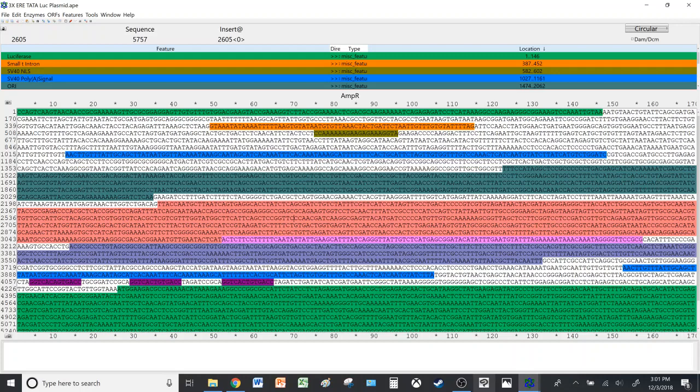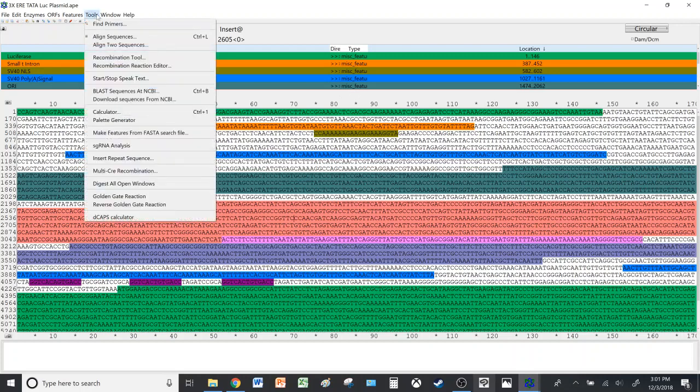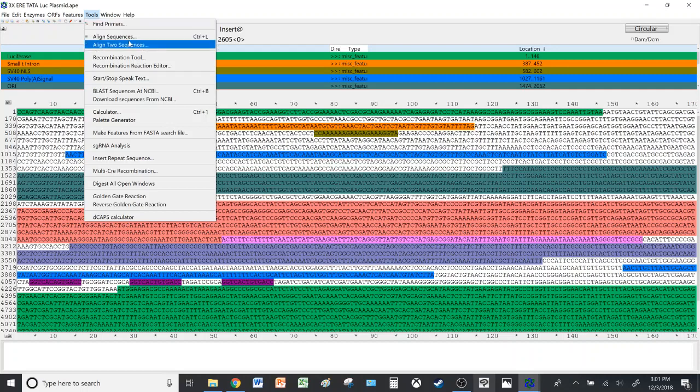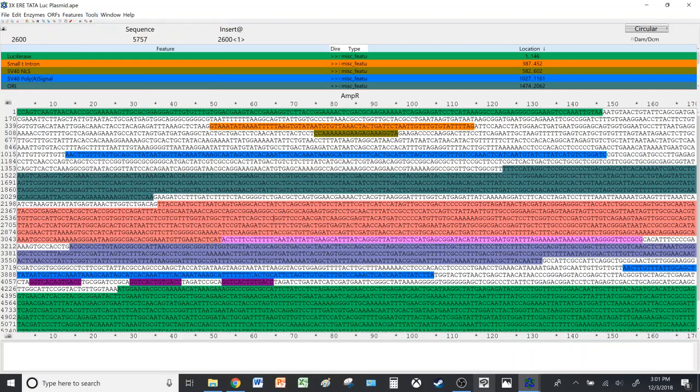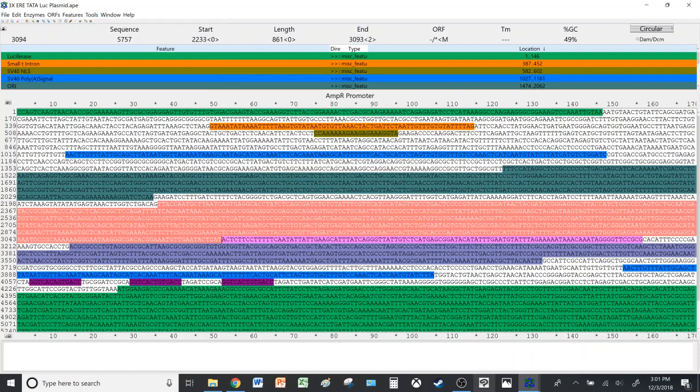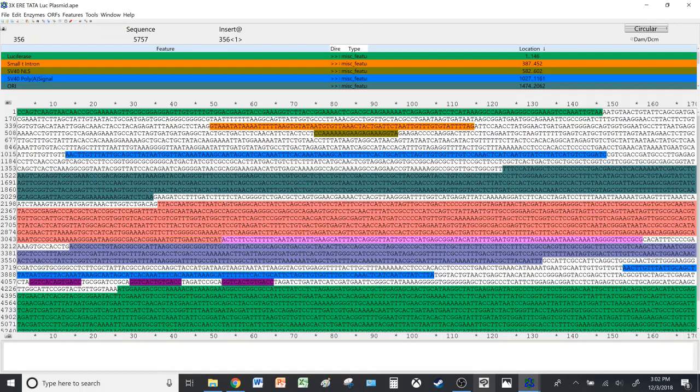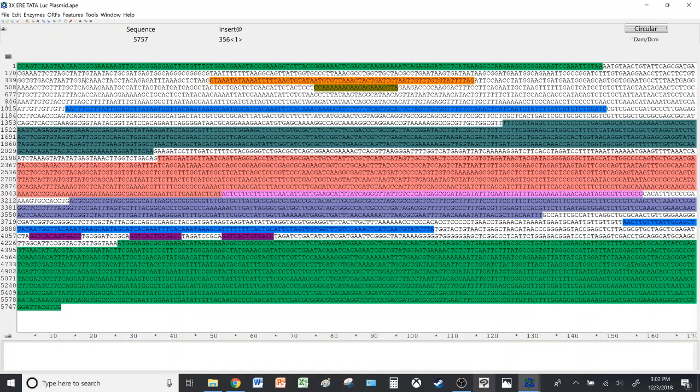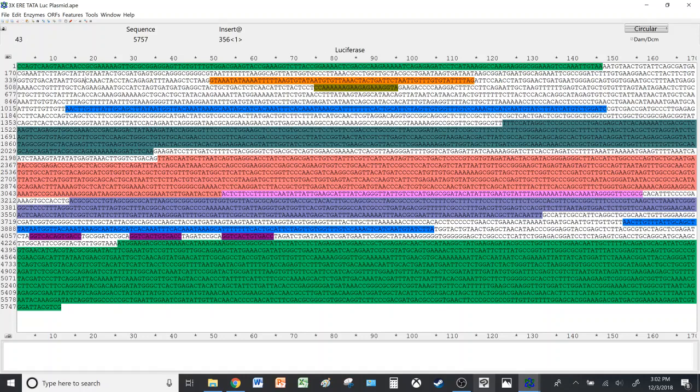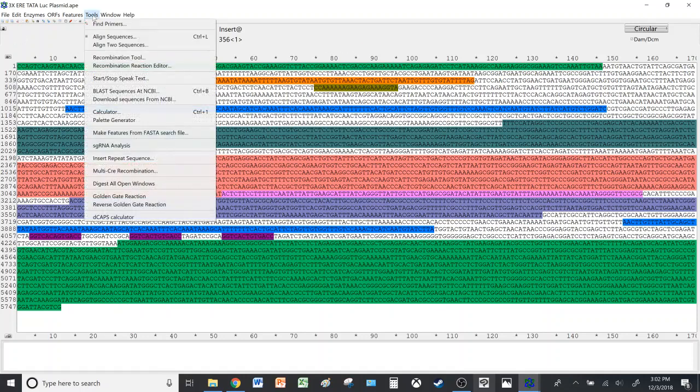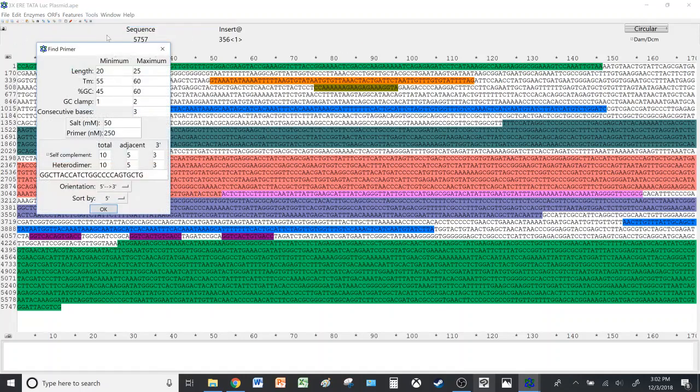Now if you would like to design primers, you can use the program to do so. If you wish to highlight a certain sequence and find the primer for it, for this tutorial we'll just look at the entire sequence for primers and see what we have. So let's go and find primers.